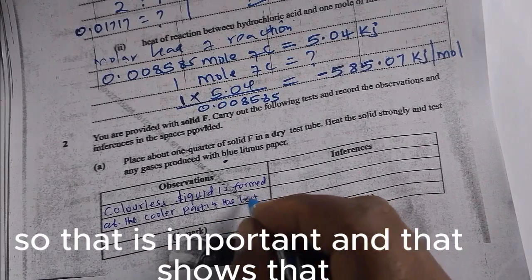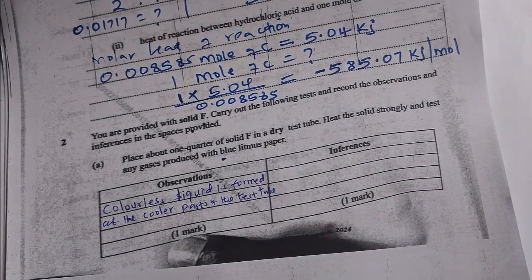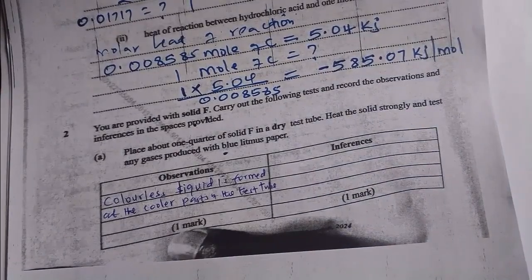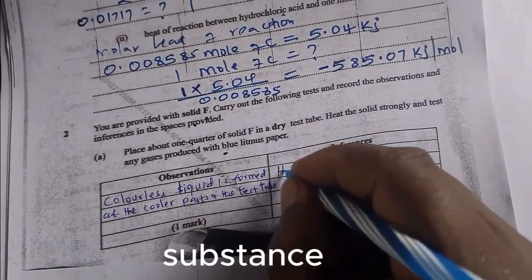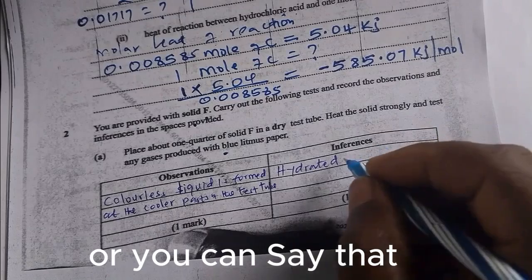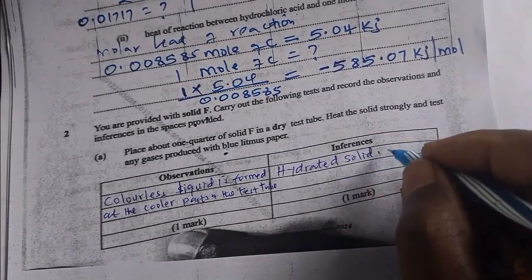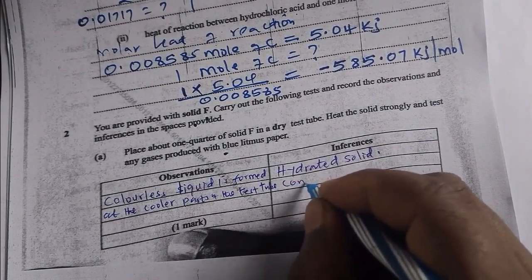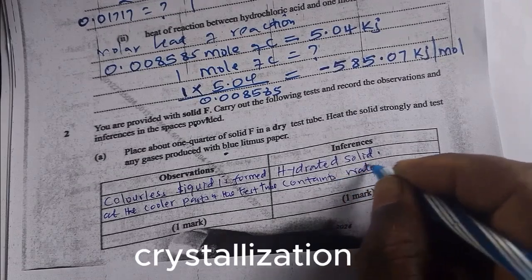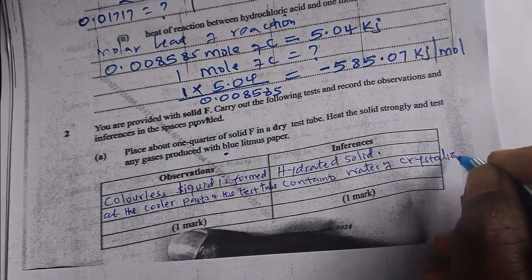That shows that the solid that was heated, solid F, is hydrated. So you can say hydrated substance or solid, or you can say that it contains water of crystallization.